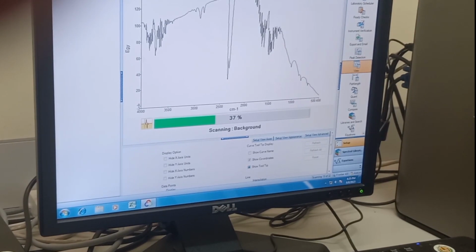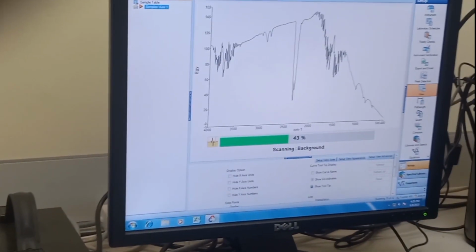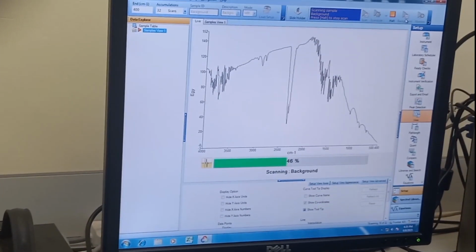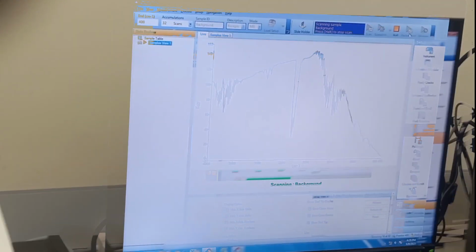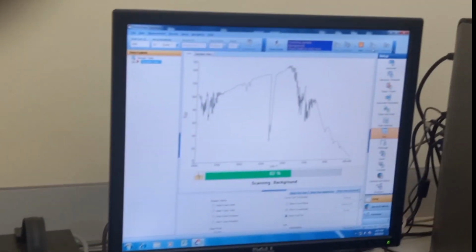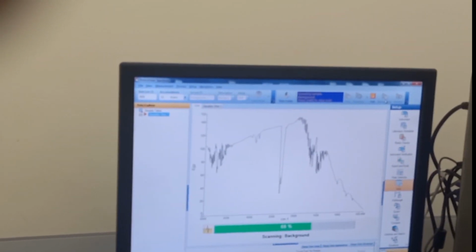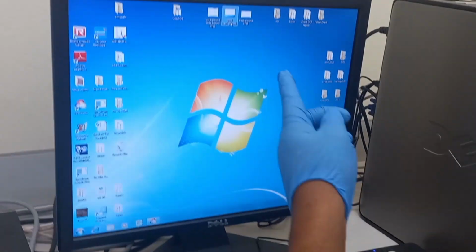Then we have direct FTIR. So there we don't mix with the KBr, that's potassium bromide. There are incidents where we prepare samples with KBr. So here we mix the sample as a powder with the KBr. So this is potassium bromide added FTIR. Then we have FTIR with microscopy. So these different types of testing need different background setups.